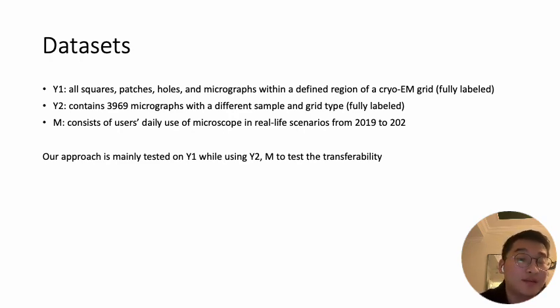And we also have another dataset called M, which consists of the users' daily use of microscopes in real-life scenarios from 2019 to 2022. The M dataset is mainly to test the transferability. It is not a fully labeled dataset.